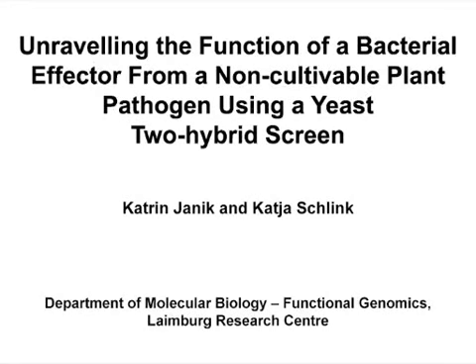The overall goal of this procedure is to unravel virulent strategies in host pathogen systems by identifying the interaction of a Candidatus phytoplasma mali effector protein with host proteins from Malus domestica.